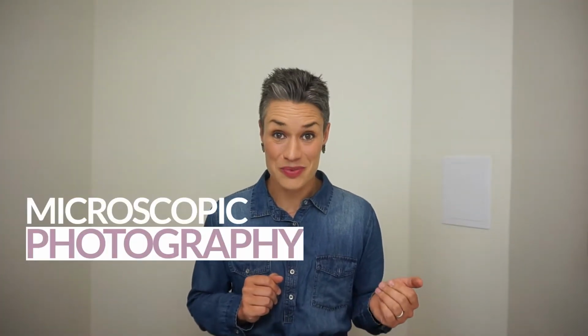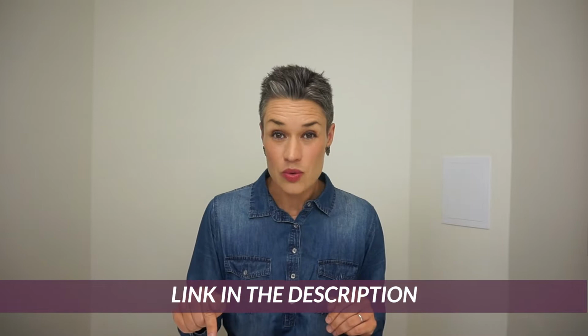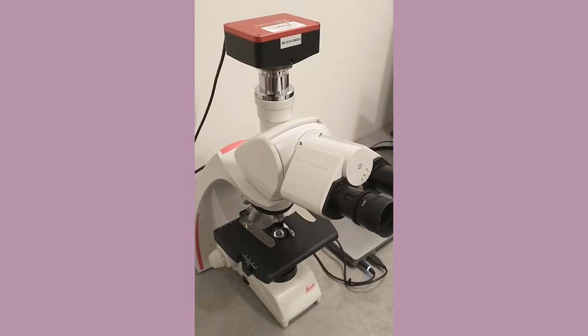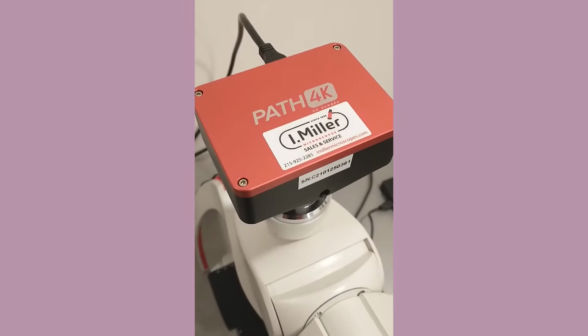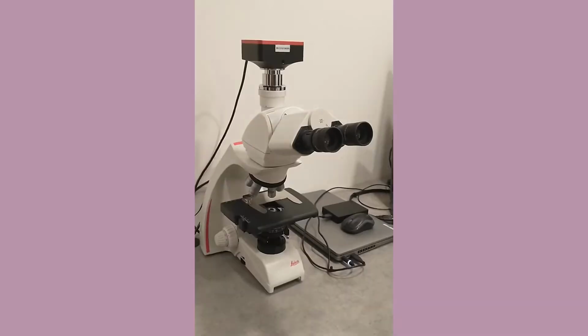I have recently decided to step up my microscopic photography game. So I got this super high resolution, 4K, Path4K microscope camera from I.Miller Microscopes. I've already published a video about this camera, the unboxing video and a general tutorial, but today we're going to focus on measurements and on annotations. Chances are that if you're taking photographs from your microscope, at some point you needed to measure. And this camera comes with a powerful but user-friendly software that enables both measurements and annotations and many different things.